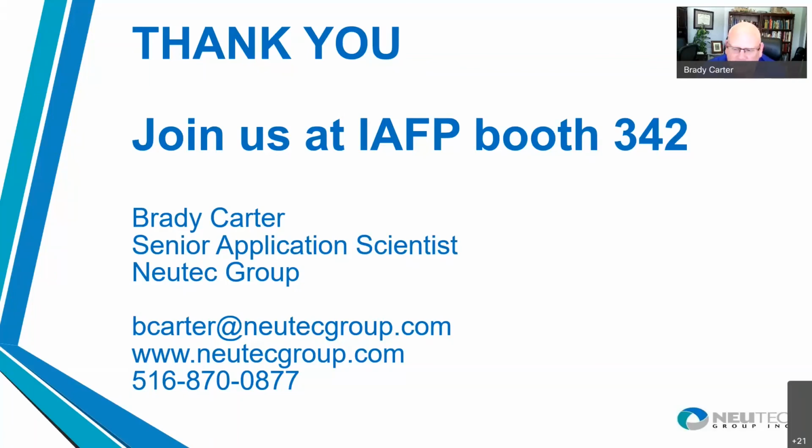And it all leads to this idea that moisture content, because there's no way to check it through standards, is all relative. And because they changed methods, this often happens. Different methods will give different moisture content for the same product. And so it's very dangerous to try and use a moisture content specification to protect it. Water activity wouldn't have failed them, because water activity is what controls the microbial growth. So the main problem that happened here was that they weren't using water activity to release. Had they been doing that instead of moisture content, they would have never had any problems.